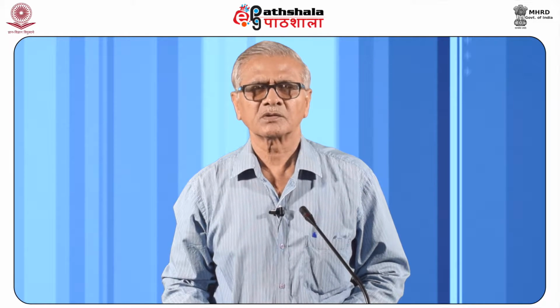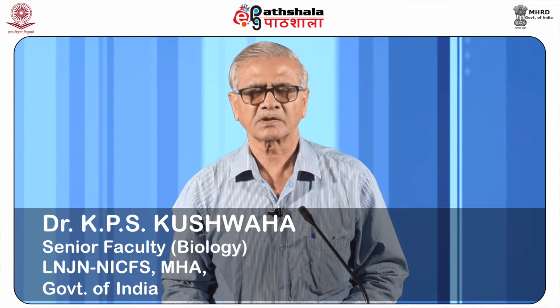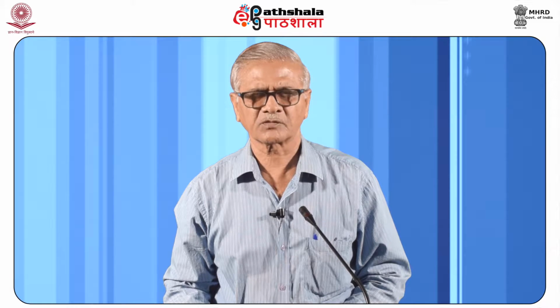In this module, I will talk about DNA sample collection and handling. After learning this module, you shall be able to understand the types of evidence material from which DNA can be extracted, the method of collection and preservation of evidentiary material, and the method of packaging and transportation of evidentiary material.